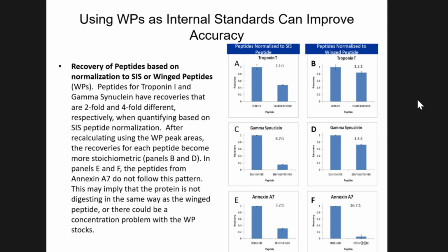Yeah, I suspect it's because plasma has so many proteases. By the time everything was spiked in, what we would do is add plasma to urea beads, and then add the standards into that. So it's completely different. I mean, there are, again, a lot of assumptions to be made about the sample and whether things are active or not, but yeah. All right.